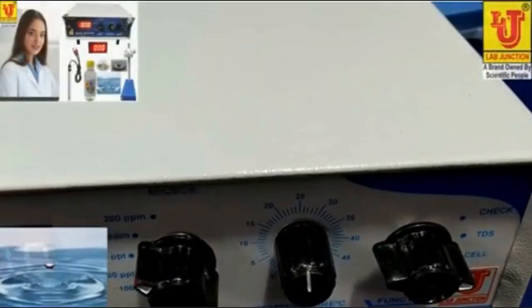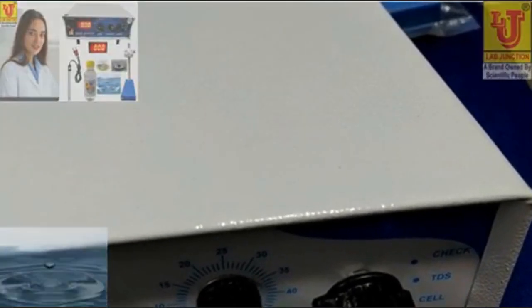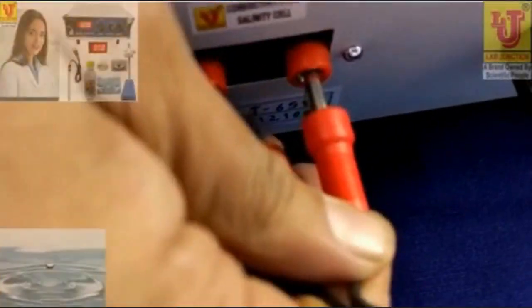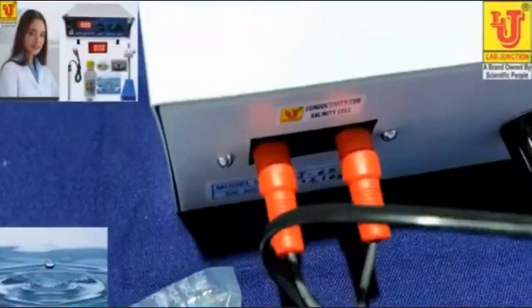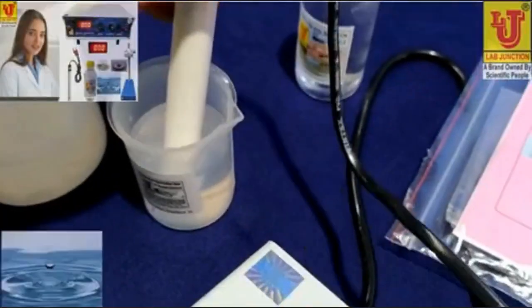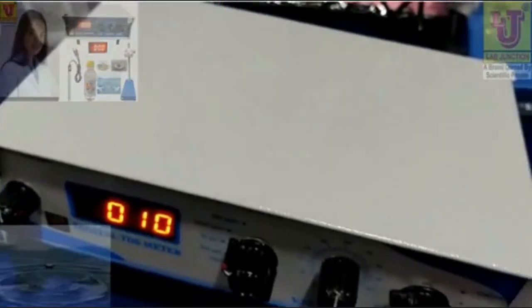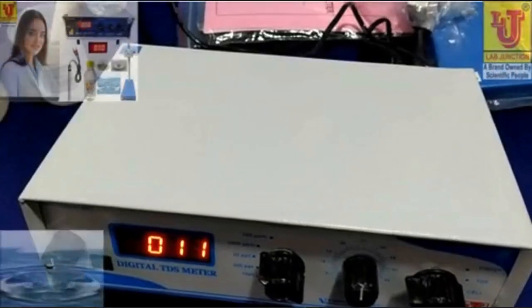Now I am connecting TDS cell to this TDS meter. You just plug this in and dip in distilled water before half an hour of testing schedule.